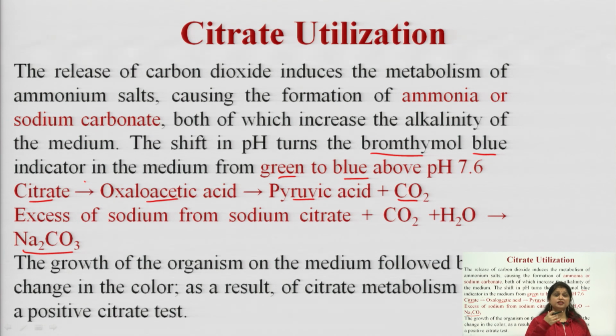When citrate is metabolized into oxaloacetic acid, the color of the broth will remain green. Then that will be metabolized into pyruvic acid, and pyruvic acid will be released along with carbon dioxide.